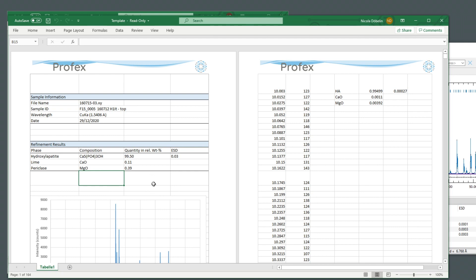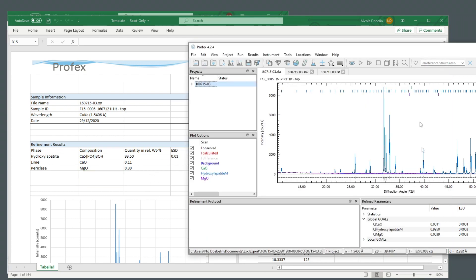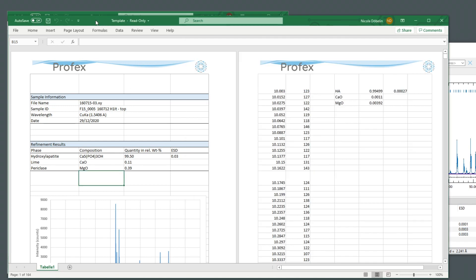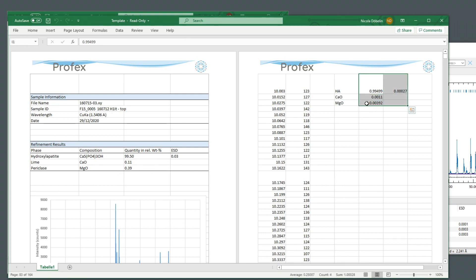You will also notice that instead of showing the phase quantities normalized to one, it shows the percentage, so multiplied by 100. And I used a little trick to do this. I'm actually exporting the results from Profex to these cells here on a page that is not printed, on the second page.